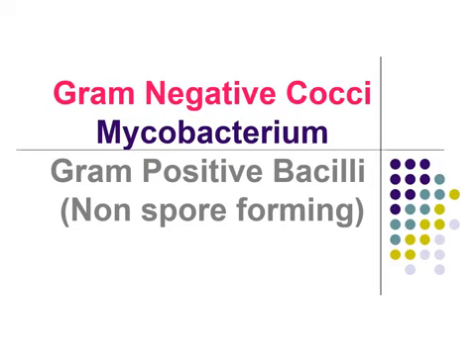Today I'm going to talk about a group of bacteria that we previously discussed in the theory lecture. These bacteria include Neisseria, Mycobacteria, in addition to gram-positive non-spore forming bacilli, which is Corynebacteria.